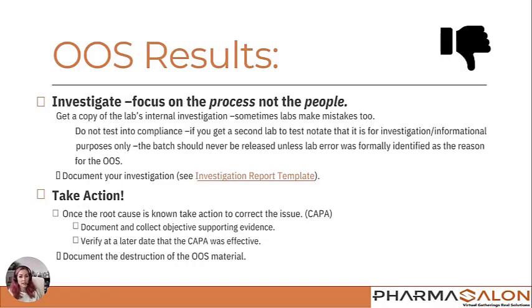The second lab test should really just be part of your investigation when trying to figure out where things went wrong or why you have that OOS. You want to document your investigation. So we're going to have a little review of the investigation report template. I provided that for you as well. It's also a Word document, so you can edit that. We'll look at that on the next slide.